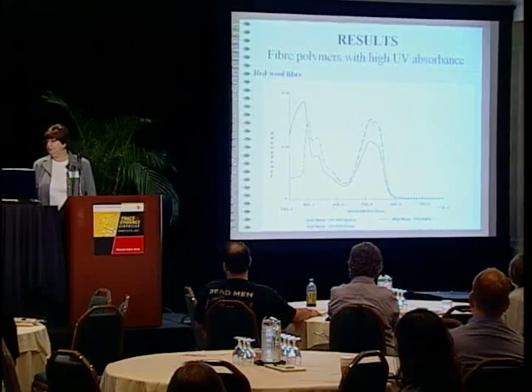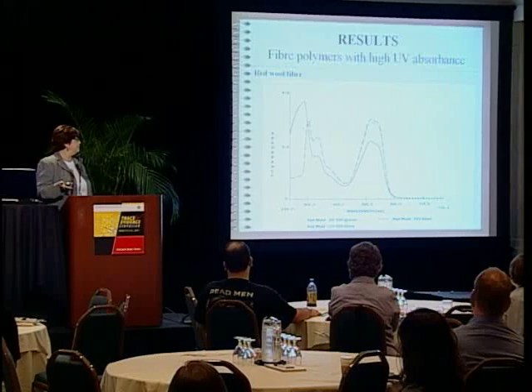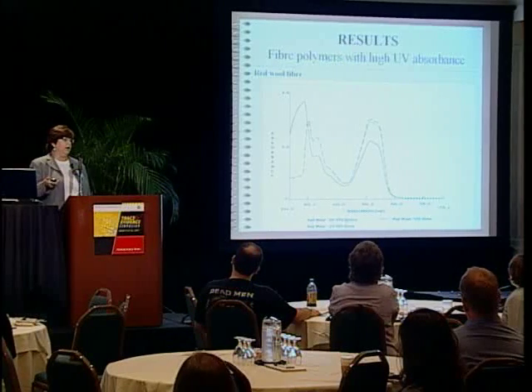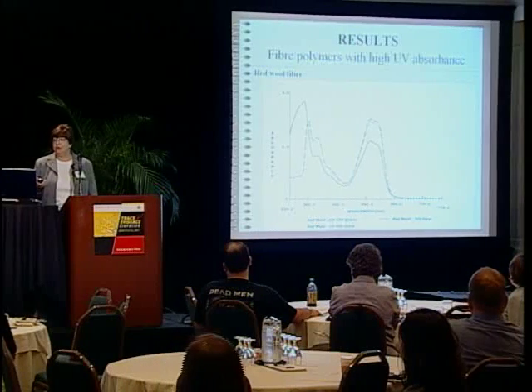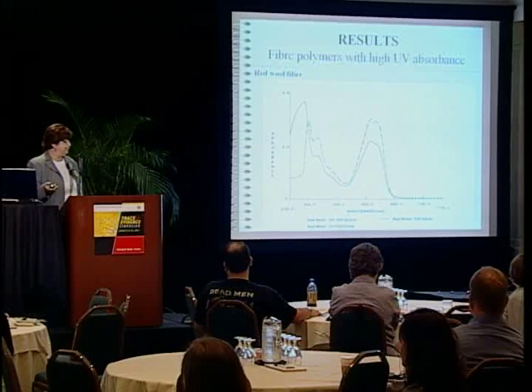You'll notice that it has below the 300 nanometers a high peak, a very large peak, and this is very similar to the peak that was observed with the non-dyed white fiber. So we can conclude that this is from the polymer itself. But we noticed that within the range between 300 and 380 nanometers, there is an additional peak there that can be included in the discriminating power.